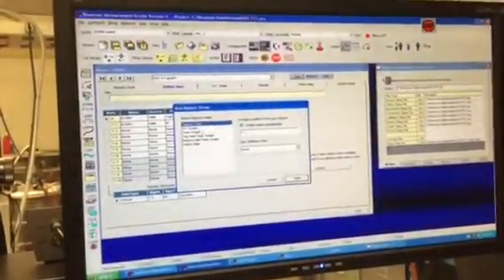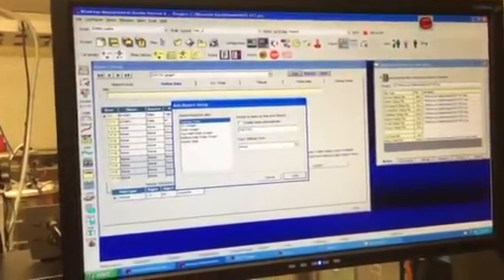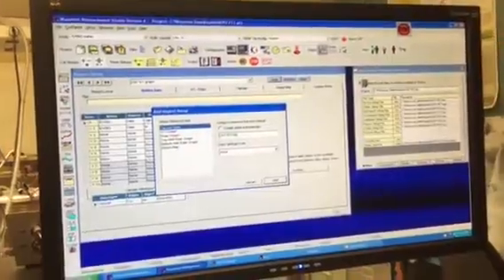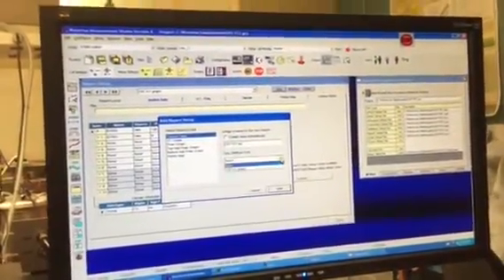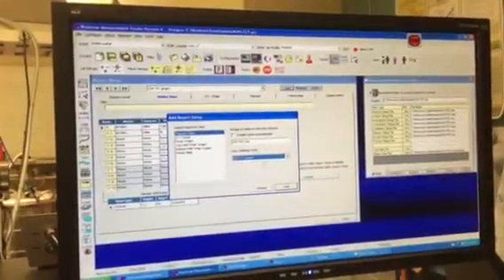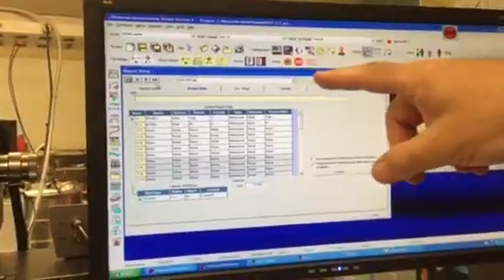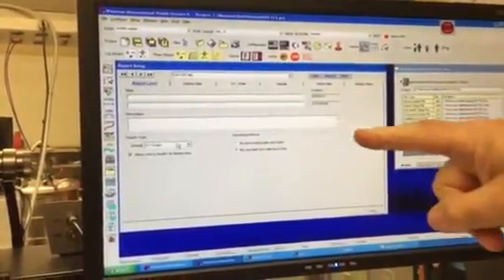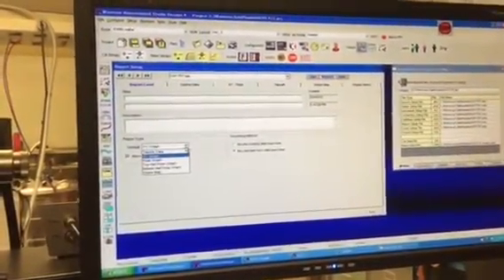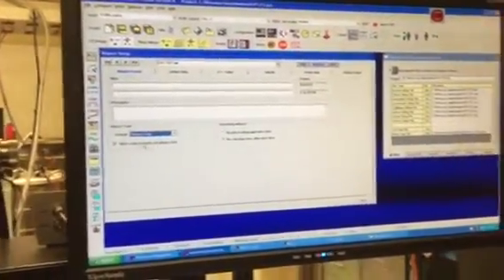So one of the things about the copy is, let's say you say tabular report and you give it a new name, and you say copy it from the previous one. It doesn't matter, unfortunately, that you told it the new one's going to be tabular. When you say add, because it copies, go back to the report level. It automatically put it to graph, so you have to change it back to tabular because it did a copy. Okay, so we can change it here. It said you wanted me to copy, so that's what I did. I made a graph.